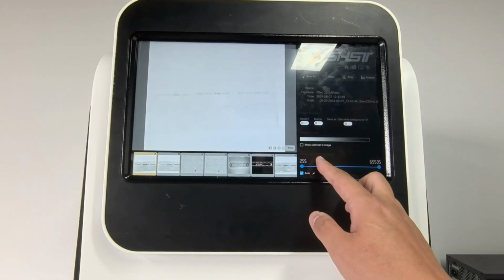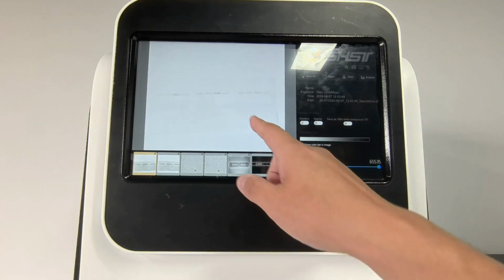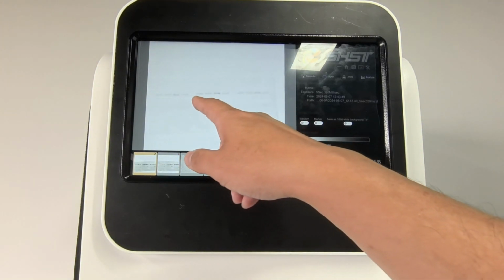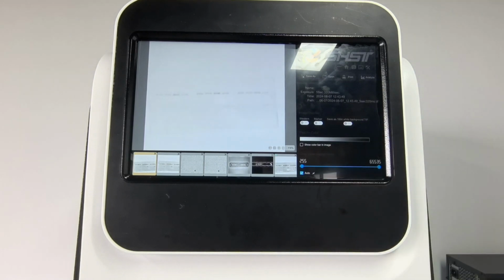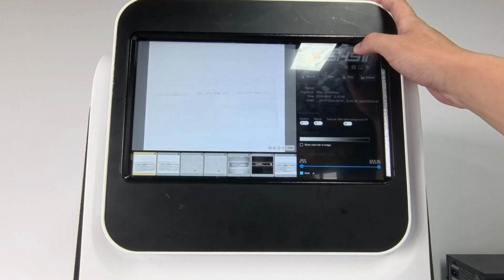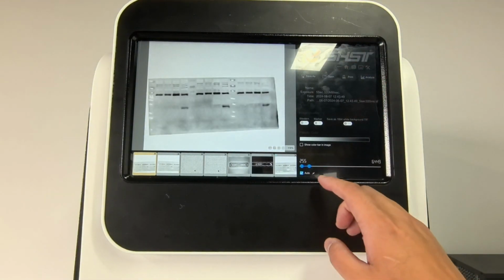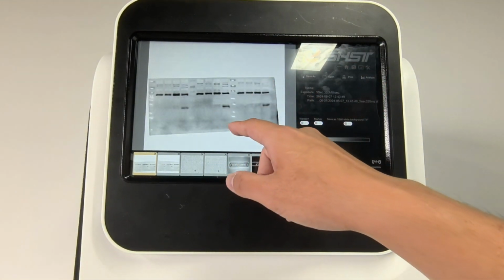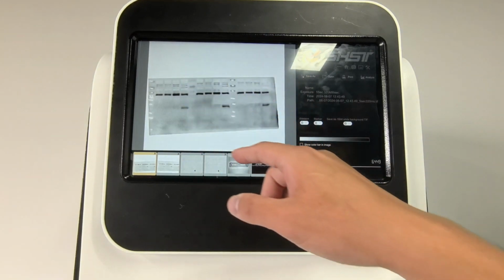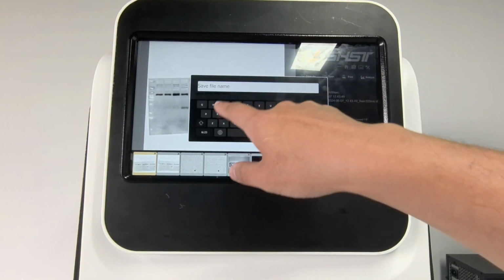So at the full display range, we can only find the weak signals. So please do not be surprised why the images display a different effect in Windows and in our software.